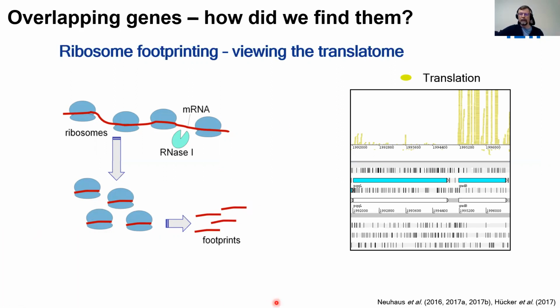So when we now have the genome of a strain, you see the open reading frames, which are known to produce messenger RNA at first and then a protein later. We can measure along the gene these footprints of the translated messenger RNA, and these are these little reads which you can see here. And this gene has a relatively weak value, so low number of reads, and here high number of reads for this gene.